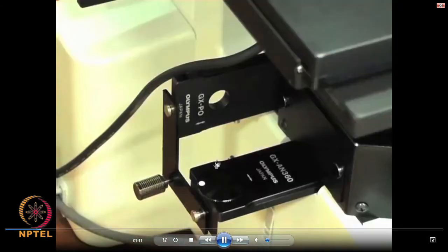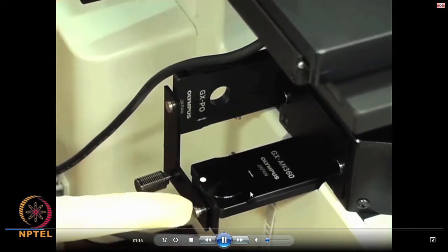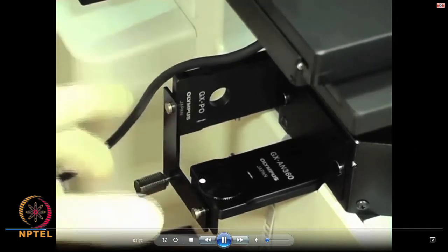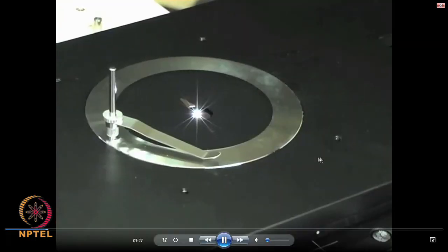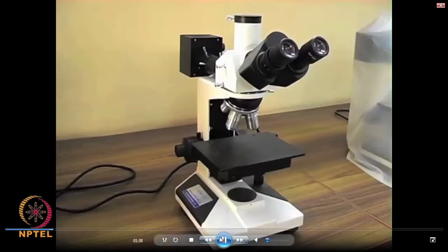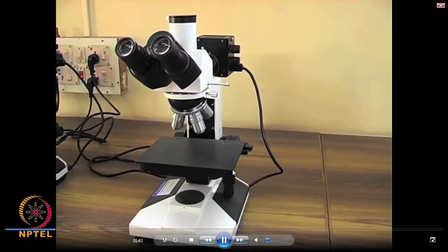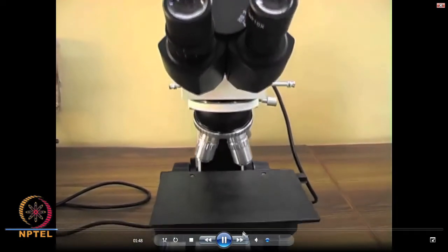I also told you that this is attached with a CCD camera, also with some polarizers and analyzers and so on. These attachments, we will take up as and when we deal with the variations of the microscope. So what you are now seeing is an illumination stage where the sample is kept. And this is a simple vertical type metallurgical microscope, which I introduced in the last class. So this is just to have a look at it again.